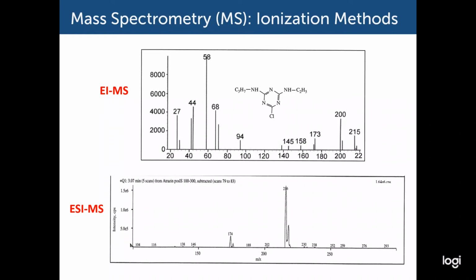It's also the case that what are called high-resolution mass spectrometry techniques, where your M/Z ratio would be not whole numbers, but out to 4 or 5 decimal places, are almost always going to operate using ESI mass spec types of techniques.